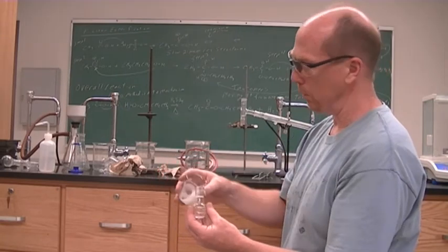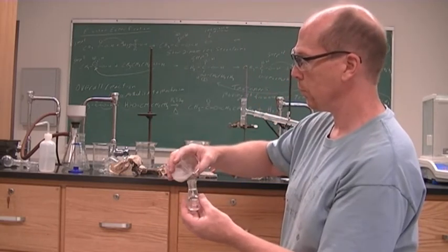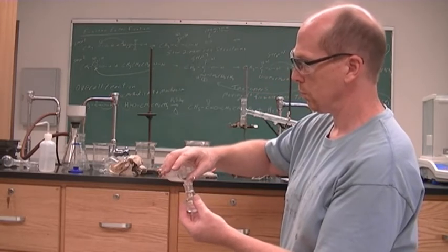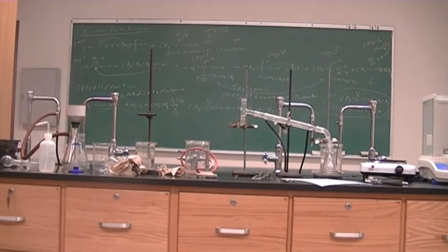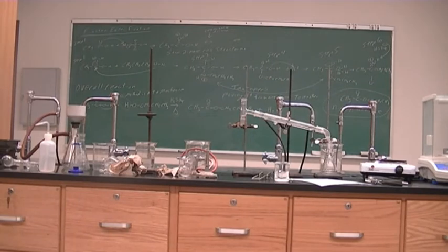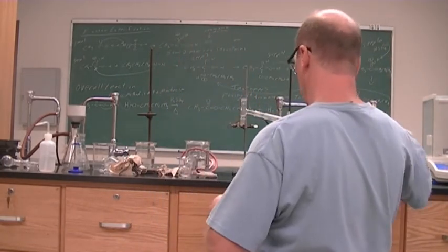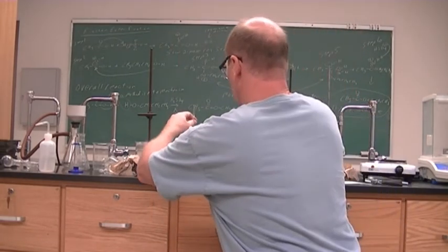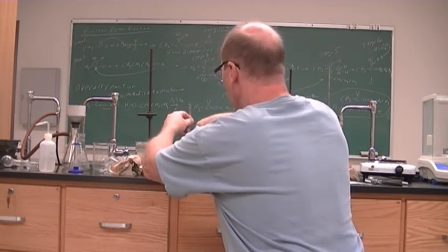I'm trying to not get very much, which is definitely going to hurt my yield, but try to block the solid.